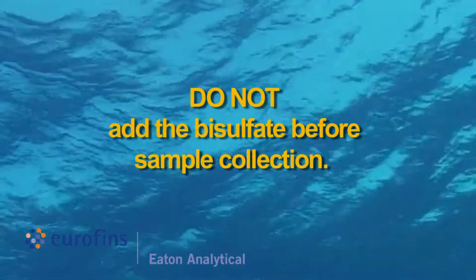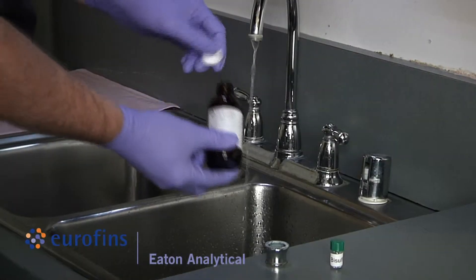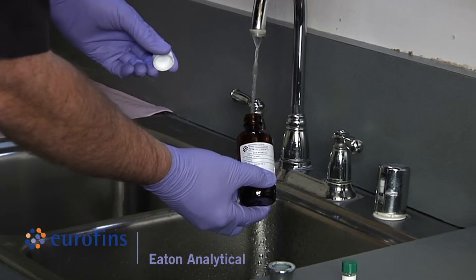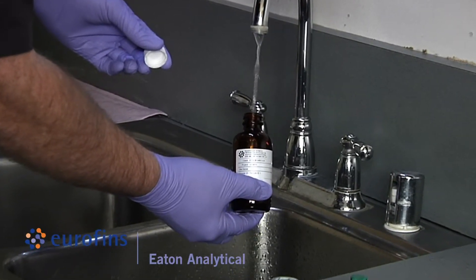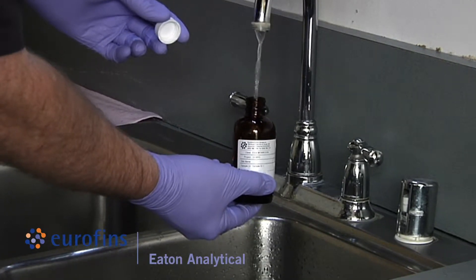Do not add the bisulfate before sample collection. Start sample collection by filling the sample bottle up to the bottom of the neck, taking care not to flush out any preservatives and making sure the mouth of the bottle does not come in contact with anything other than sample water.